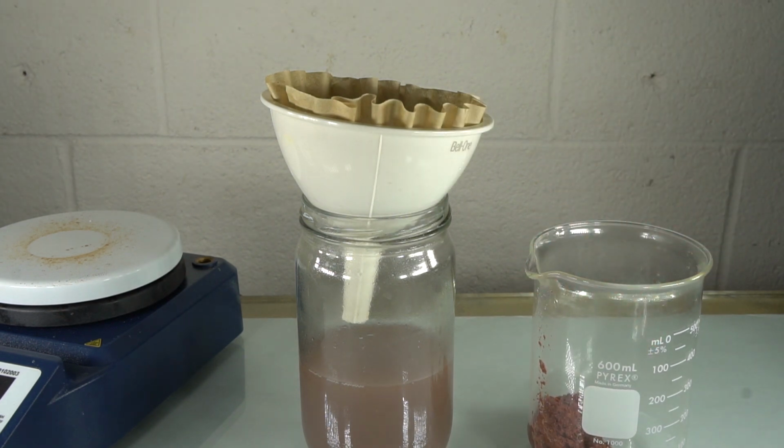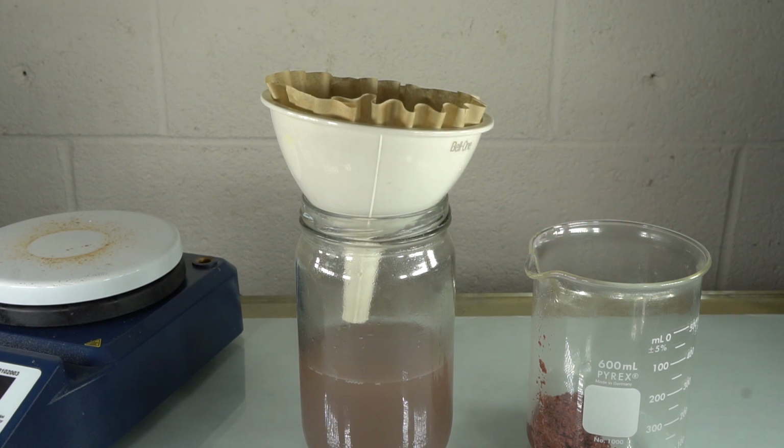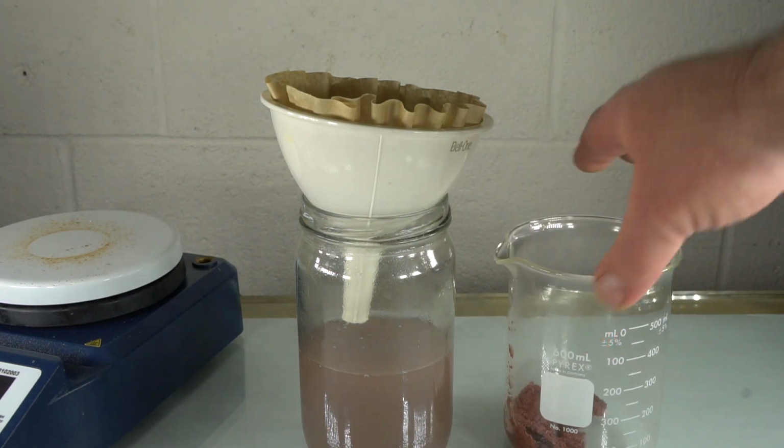This solution is mostly aluminum sulfate, which we can crystallize. I'm not sure why this is reddish brown. The other times I've done this experiment, the liquid is quite clear. It looks like there's a little bit of copper that may be so fine that it's just suspended, and it's going through the filter paper that's discoloring it. But that's mostly aluminum sulfate. So I'm going to scoop this out and then we'll take a look at it.